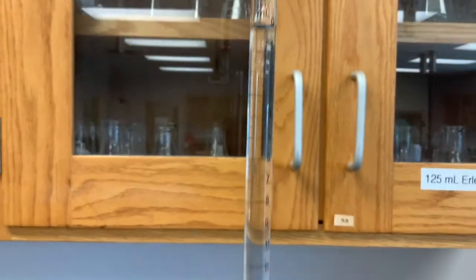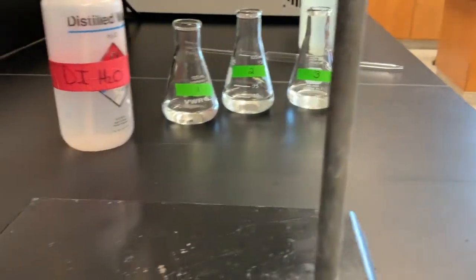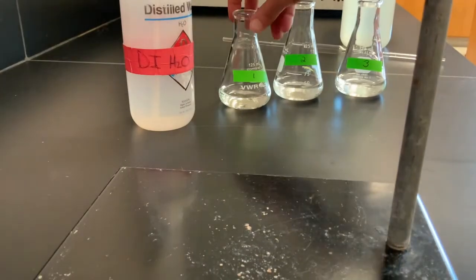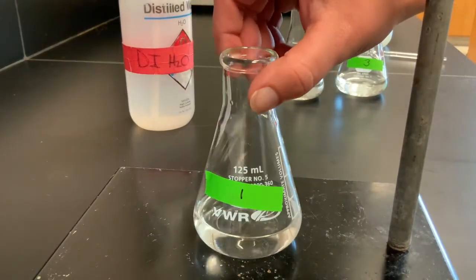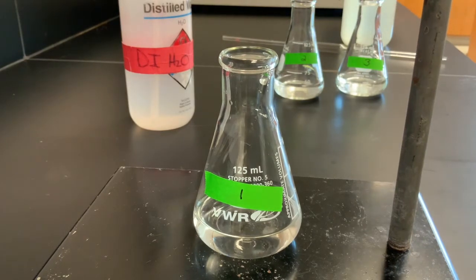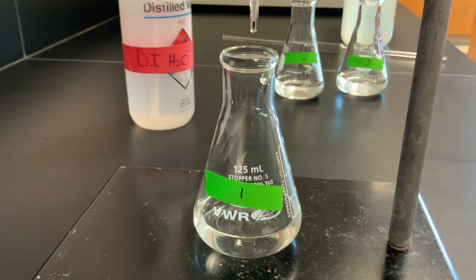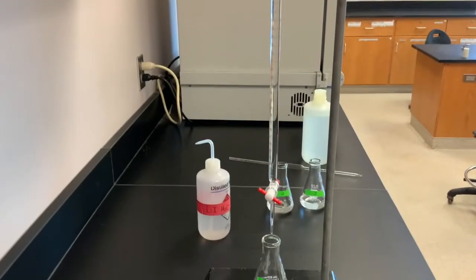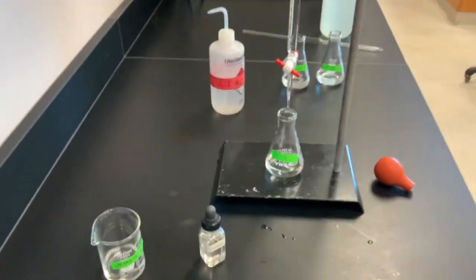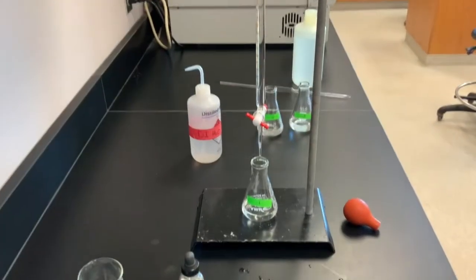So now we're ready to perform our titration. So we're going to take our samples. We have our hydrochloric acid with our phenolphthalein in it. We're going to adjust our burette clamp so that we have our burette just over our flask. So we've got our flask with our hydrochloric acid. We have our burette.